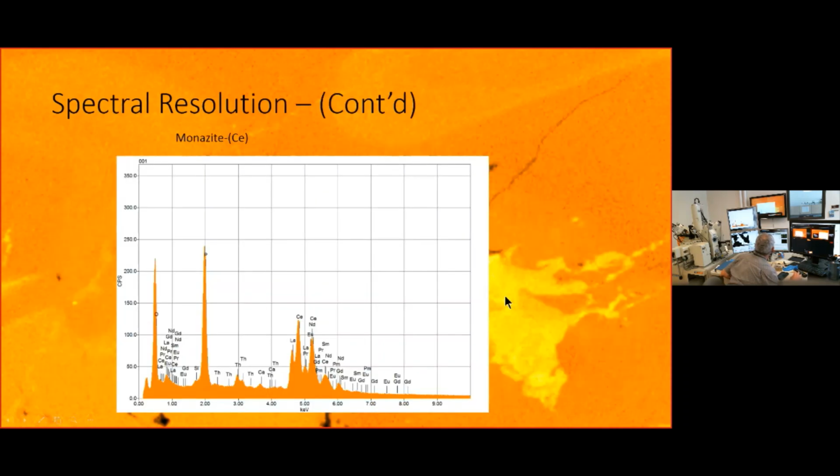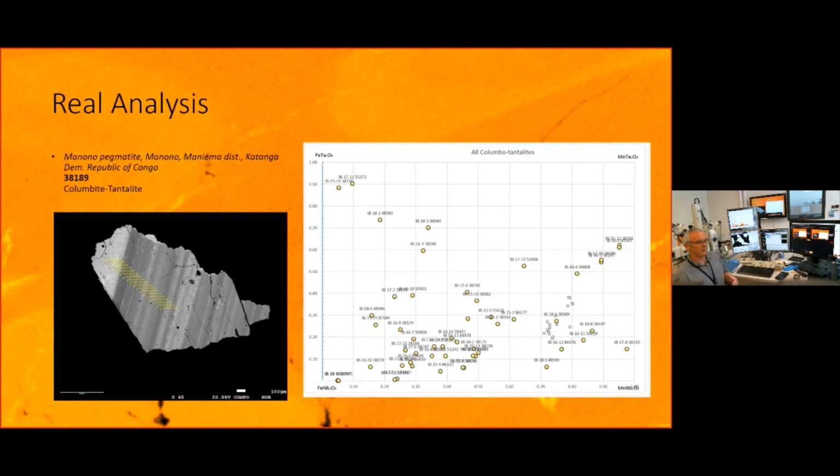All right. So, what's involved with WDS? It's not as simple as putting a sample in the machine. Okay, I'm going to go about 5 more minutes and I'll answer questions as long as people have questions. It's not like EDS, where you put the sample in, put the beam on it, and you measure the X-rays coming off. I have to do a lot of prep work, a lot of exploratory work, figuring out how I'm actually going to measure to get proper results. Like any analytical equipment, garbage in, garbage out. So you really have to prepare in advance how your sample is going to be measured.